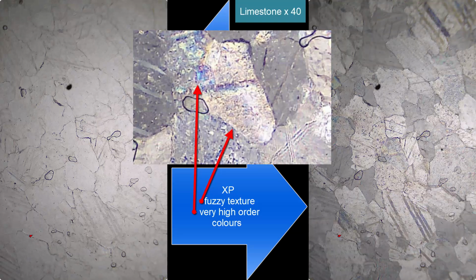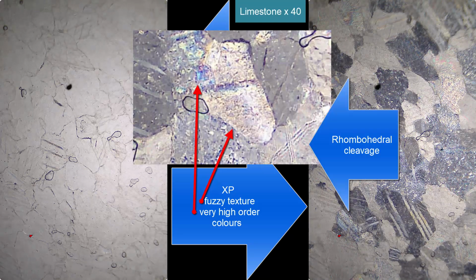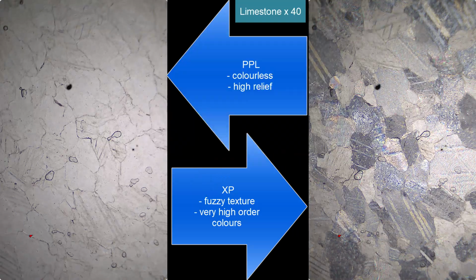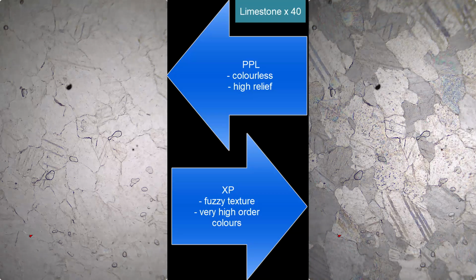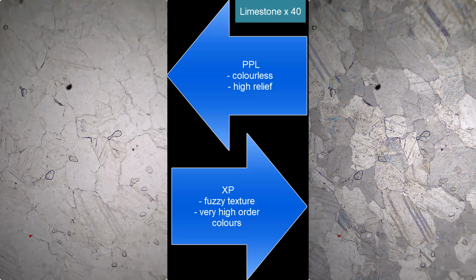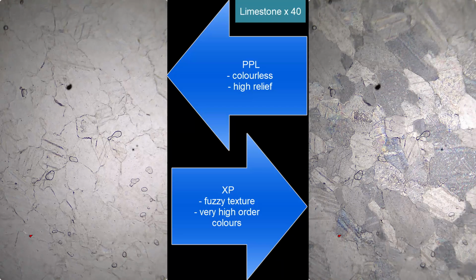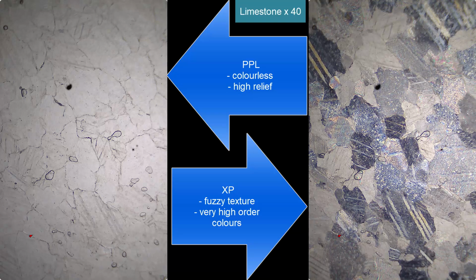And you can even see the rhomboid cleavage. Cleavage is very difficult to see because you have to cut the crystal at the very end, and that's very specific. There's a higher probability you've cut it at every other angle besides straight end on. So I'm not using cleavage planes in this video, although it is in video 1, you could see all the numbers listed there. You might be lucky enough to see one.